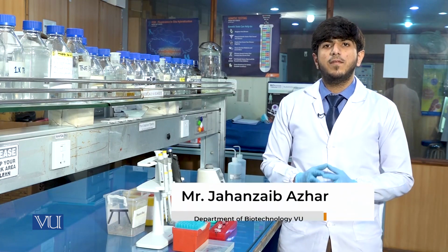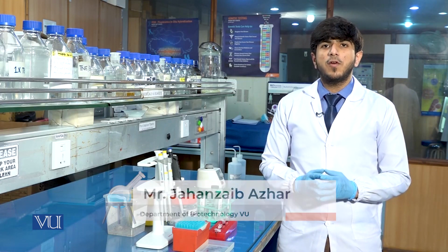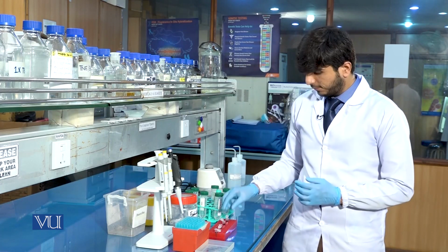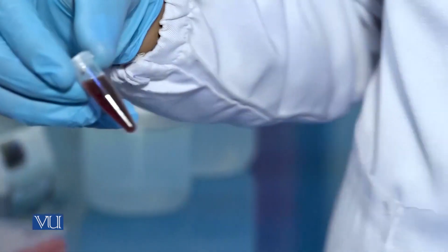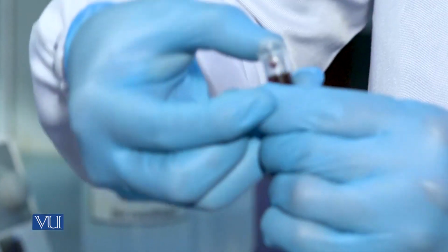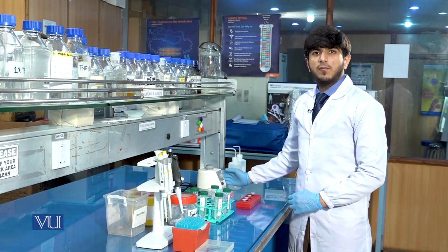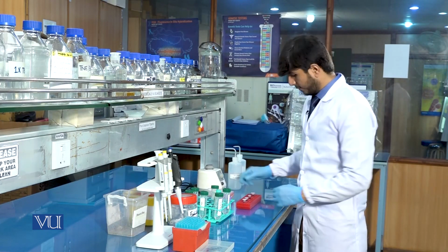After the addition of 1000 microliter lysis buffer, we will vortex the sample for 5 minutes. This is vortex machine, and we will now vortex the sample to homogenize the mixture.